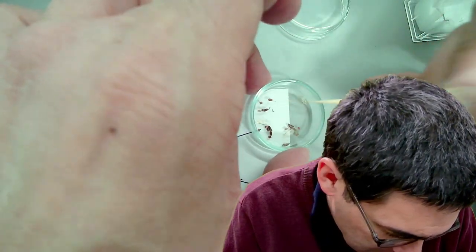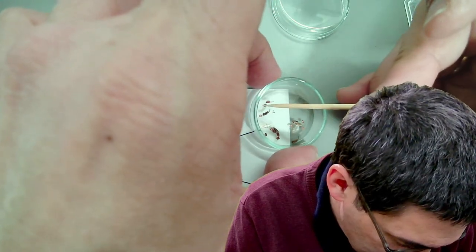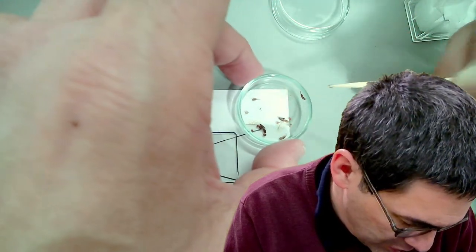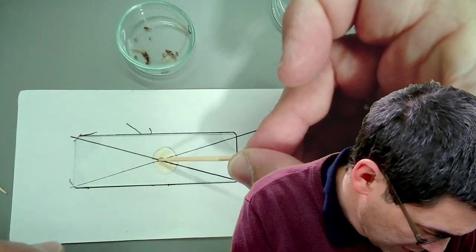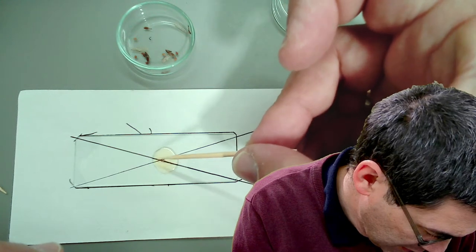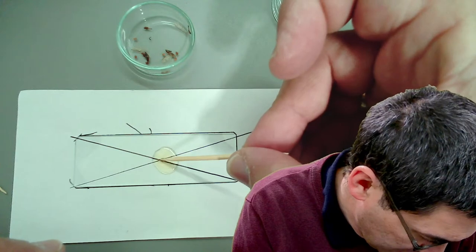And I think, where is it? I think it must be this here. Is this? There's something else connected as well. Let's give this a try. Does it come off? It comes off. Good. Always make sure that it's properly submerged.